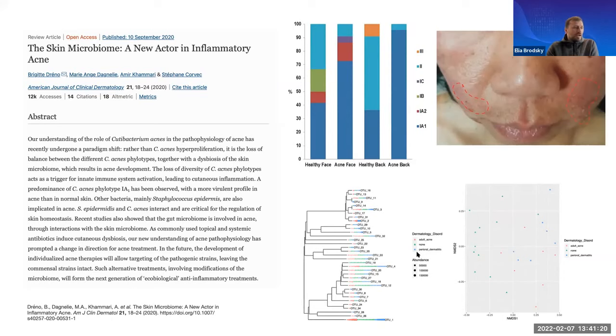So in this case, the difference is represented in this image right here, which is a non-metric dimensional scaling plot that allows us to see different samples positioned in this two-dimensional space and maybe show us specific grouping based on this annotation, giving us a sense overall whether these samples are different or not. And here we have 3 different sample groups: adult acne, none, which is healthy control, and perioral dermatitis.